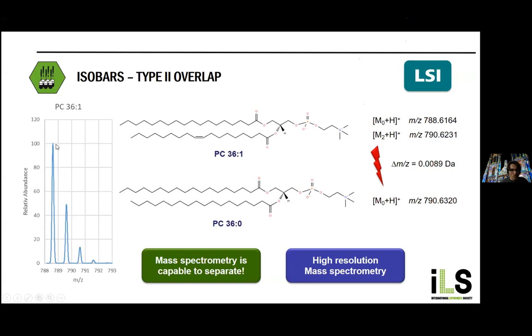And you see that you have the +2 isotope present at around 15% relative to the monoisotopic peak. This comes mainly from the C13 content. You all know that carbon 13 is present at about 1% in nature. So with the higher mass, we have a higher contribution of the M+1 and M+2 isotopic peaks.